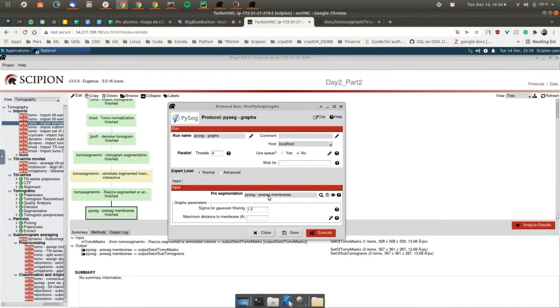These values depend for sure on the data set, and the default one is just the reference which has to be considered to decrease or increase or let it be as default, depending on your data set and on your problem.